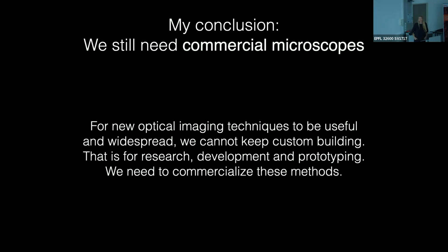I'm going to try and make an experiment and work in industry at a company that makes binoculars and learn what it is that you actually need to do in order to design a system that's robust, that you can screw in, because if you want to have one of these on your microscope, you just take the camera off and you put this black box in and you put the camera at the back of the box.